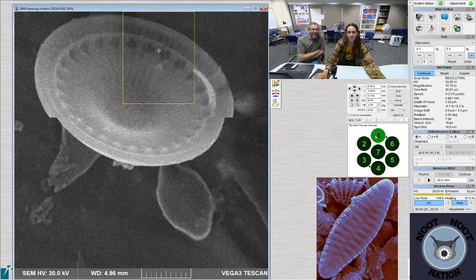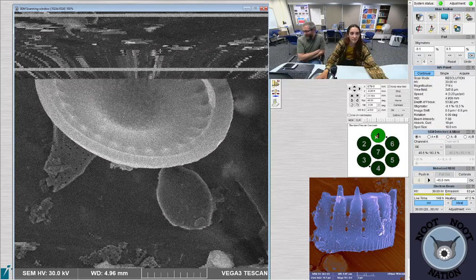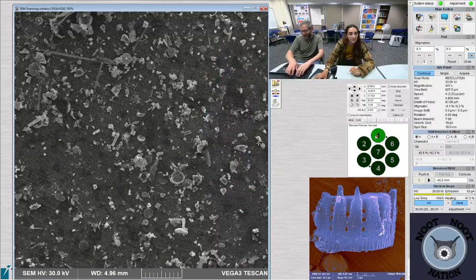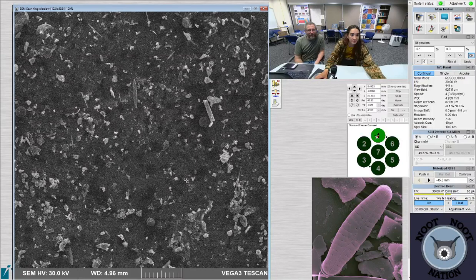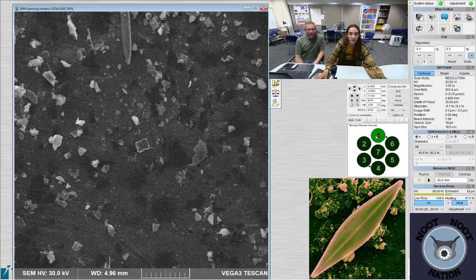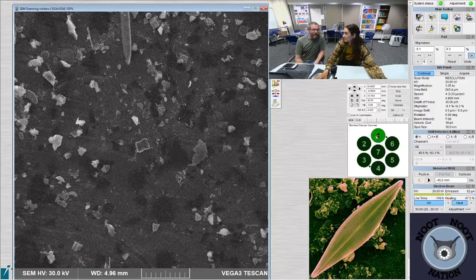I think because it's at a weird angle, it's going to be blurry. I'm not following Diatom's attack. It's so weird. Ooh. Is this one a Phytolith? Oh, what was the thing we said would be blurry? It was a Lindavia of some sort. I didn't look closely at it. Sorry. Is this a Phytolith? Yeah, that's a Phytolith, I think.